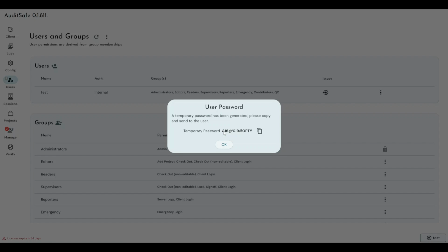So you can be sure that when you're looking at an audit trail, when you're checking the validity of data produced within your lab or within your GMP environment, where a user's name is listed, you should be as confident as humanly possible that that user has performed that work that is assigned to their name, thus trying to create the most robust electronic signatures and audit trail possible within a compliant environment, or at least as secure as we can make it from our side on the software.